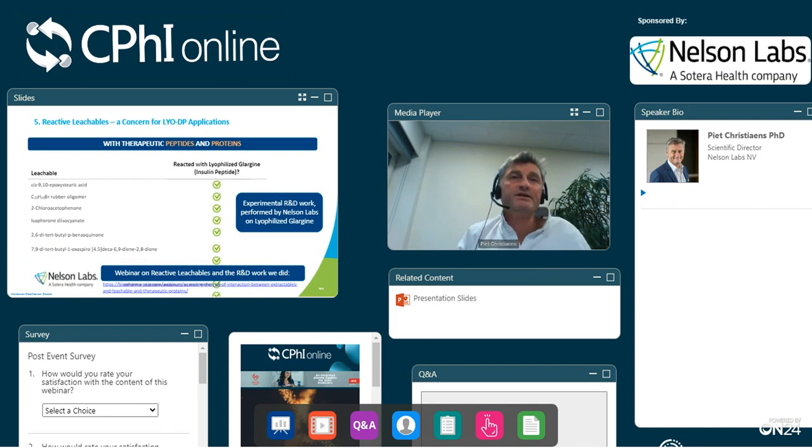What we also did at Nelson Labs is, based upon the rules and the predictions that were explained in that article, check on some of the most common leachables that we see, if that would actually take place. We selected 6 here, and we allowed them to be exposed to lyophilized glargine, which is a long-acting insulin, and it's a peptide. And actually what we saw was an interaction in all cases between the peptide and the leachables that were predicted to be reactive. If you would like to find out more on this, there's also a webinar that you can consult, and you can find the references on the bottom of this slide here.